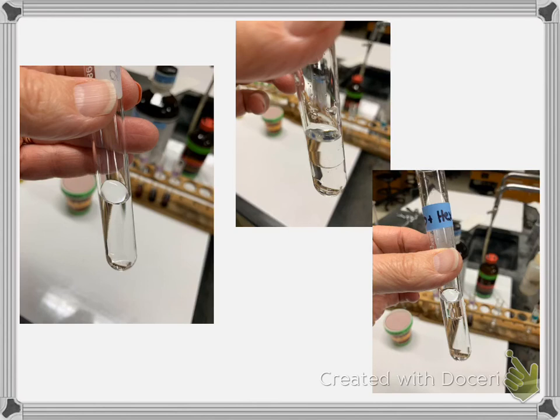So this is the first one that I did. And this is water plus isopropanol. And if you look, it just looks like one liquid. It mixed completely, so we call that miscible.